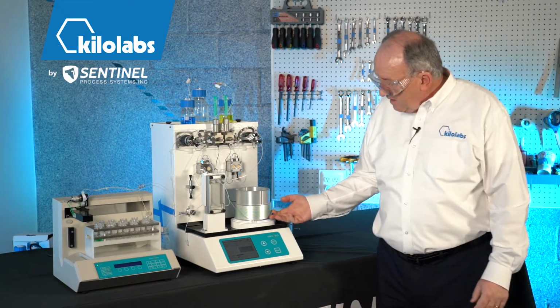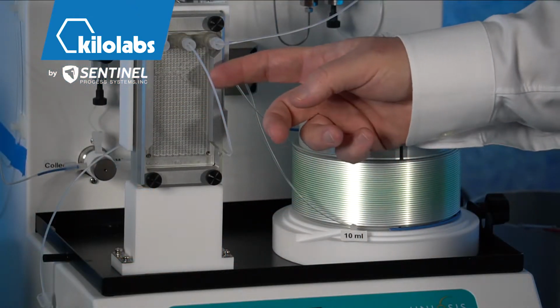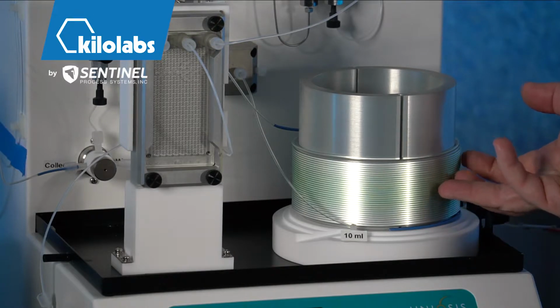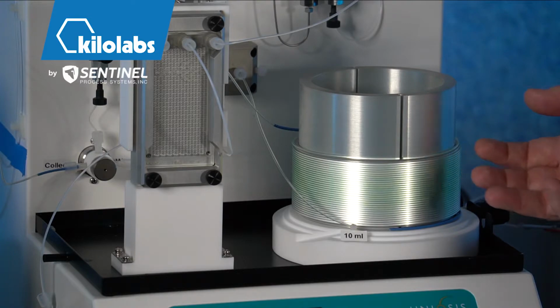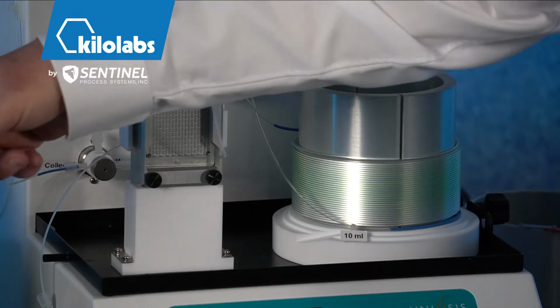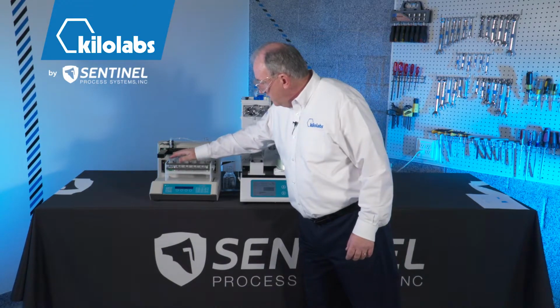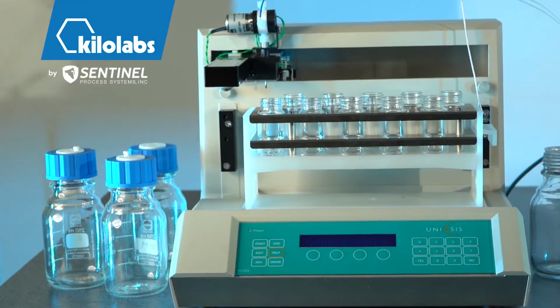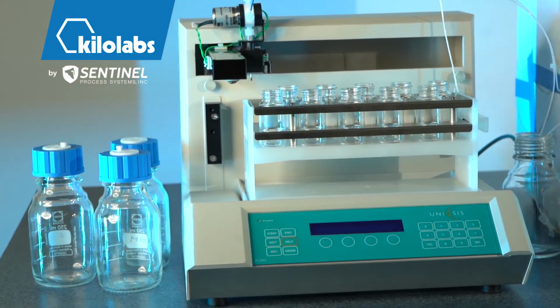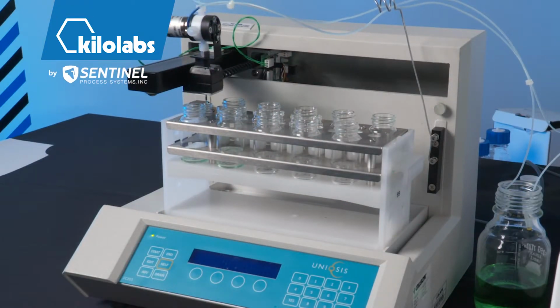So as we go back here now, the solvent has cleaned out the mixing chip, and now we're advancing that band up to the top of the coil, and pretty soon our fraction collector is going to come to life, and that sample is going to be taken, the number 2 sample. So the first sample was right here on the aliquot and the vial collector. Here we go. So we collect a little bit into our aliquot vial, and then back to our sample, and that's it. And so now we're collecting our second sample.